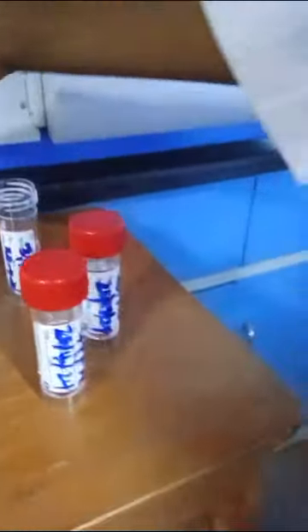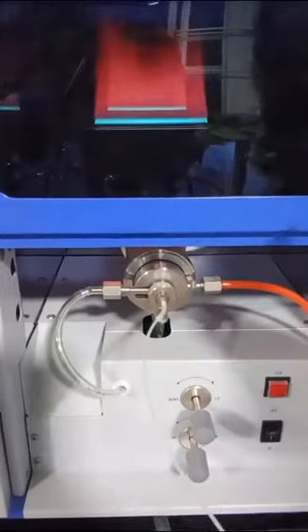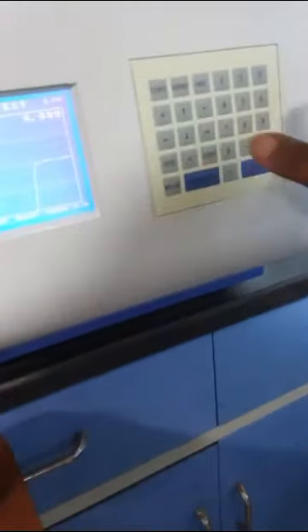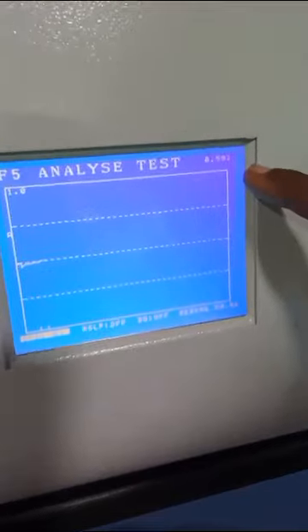So now the next thing is our 2 ppm. Okay, so now we have inserted it. You can see that there is a change in the rate at which the flame was burning before. So we now want to read. You can see the wavelength is moving, it's changing.